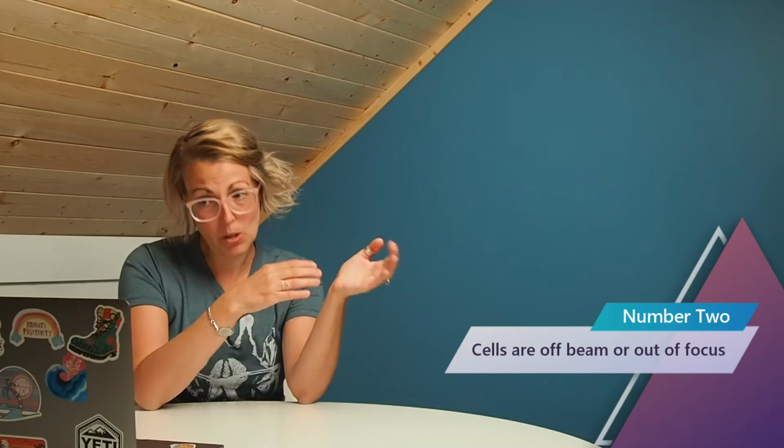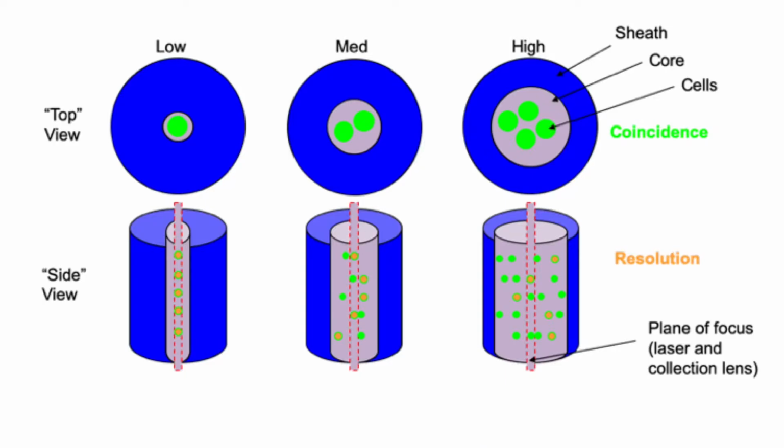A higher flow rate also increases the likelihood that your cells will pass by the laser off beam or out of focus, out of the focal plane. And because of this, you can lose some of the resolution of your data. So if we look at a cross-section of a stream at low, medium, or high, you can see at low pressure we have a nice narrow core stream that only really one cell can pass through at a time. As we move to medium pressure, this center core gets larger and more cells fit inside it. And at high, this gets even larger. And you can see many cells can pass through at any given time.